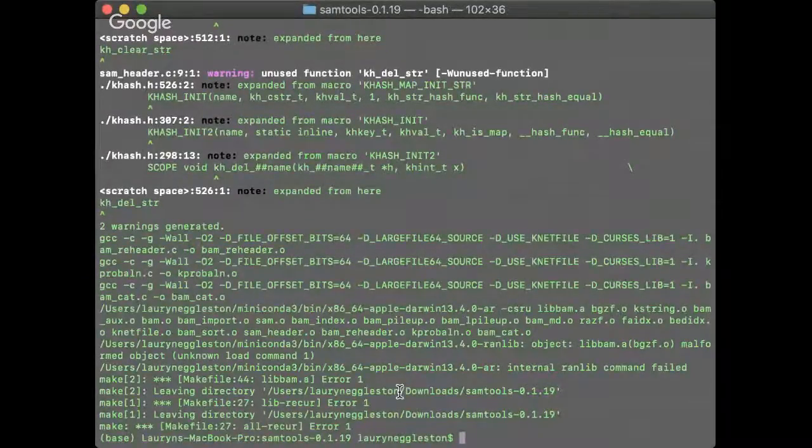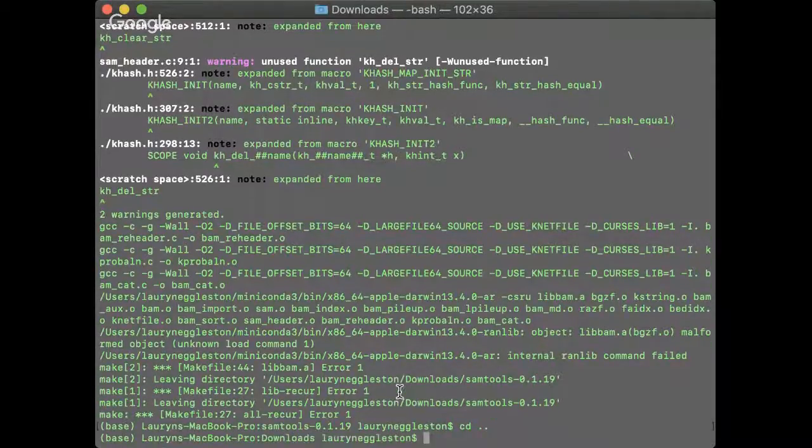I want to copy, that's not copy. Let's go into this directory.